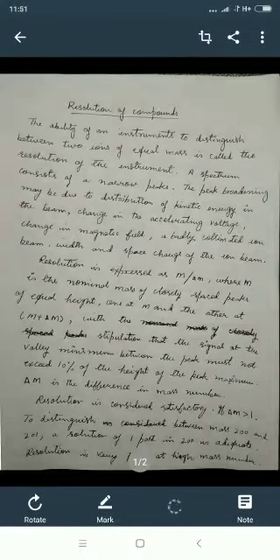Dear students, as we have discussed the instrumentation of mass spectrometry, different types of mass spectrometry such as FAB, SIMS, and double focusing spectrometry. The efficiency of spectrometry depends upon the resolution of the signals. So today we are going to discuss the resolution of the compounds.